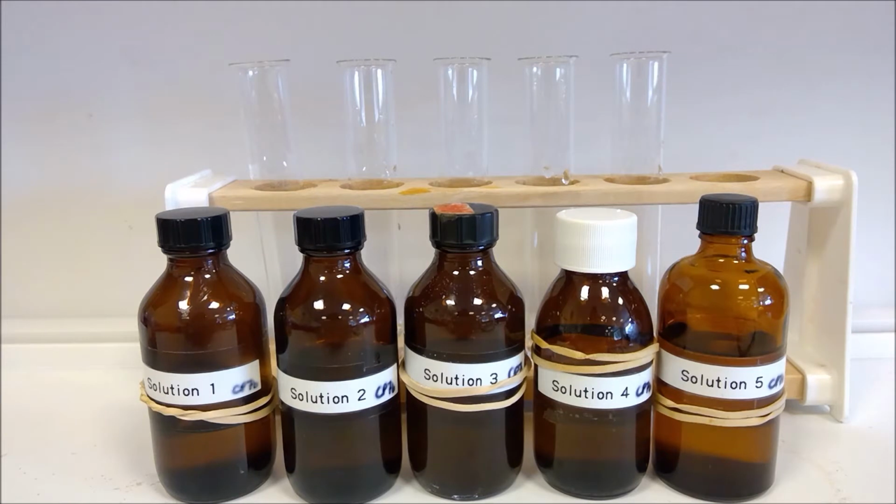Here we are identifying the anions present in 5 different solutions. So we're going to test first for the presence of halide ions. So we need to add nitric acid first, and then we'll add silver nitrate.